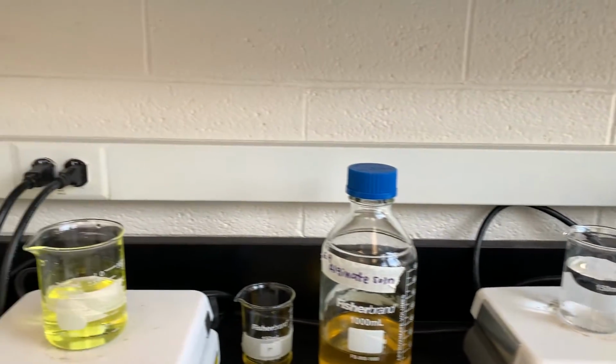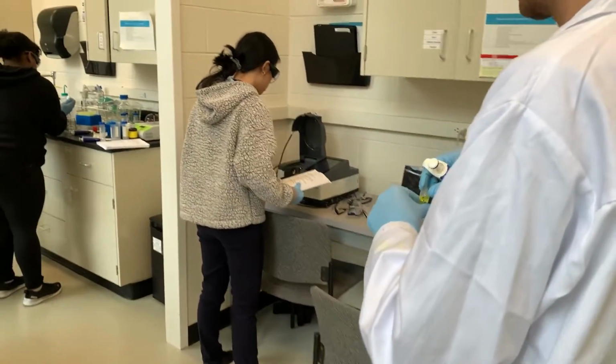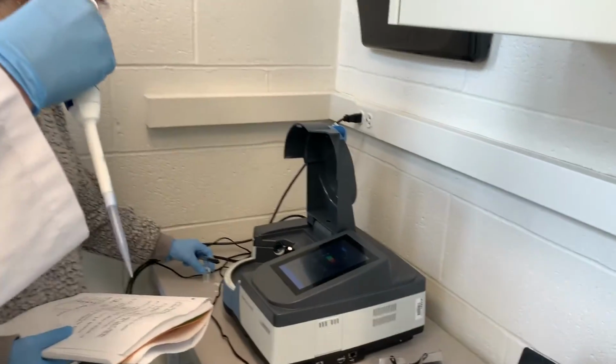After the experiment has started, we drew samples using a pipette according to the time intervals specified by the lab instruction. The samples are loaded into a cuvette and inserted into a spectrophotometer to measure their absorbance values.